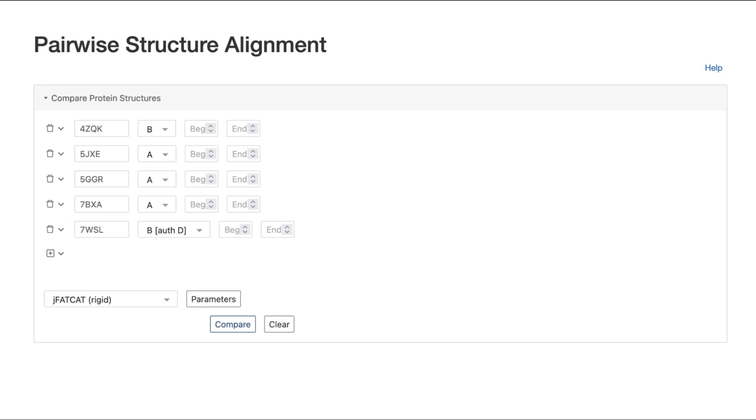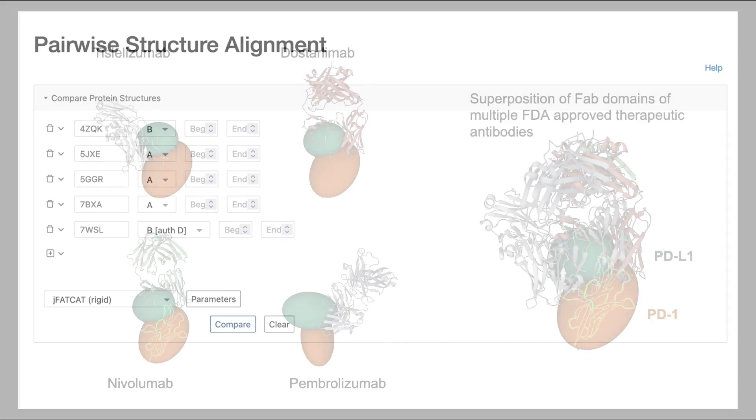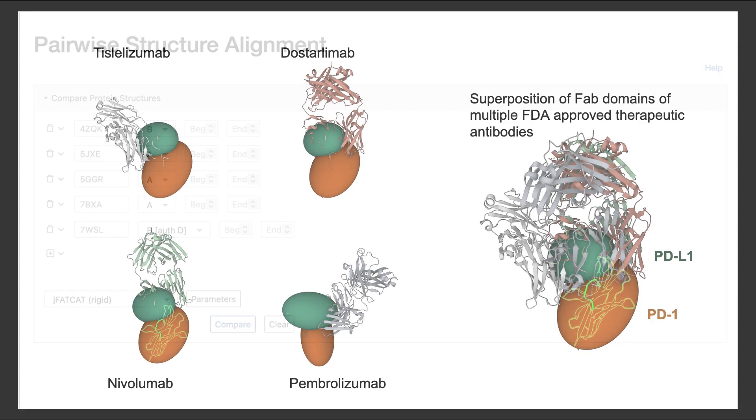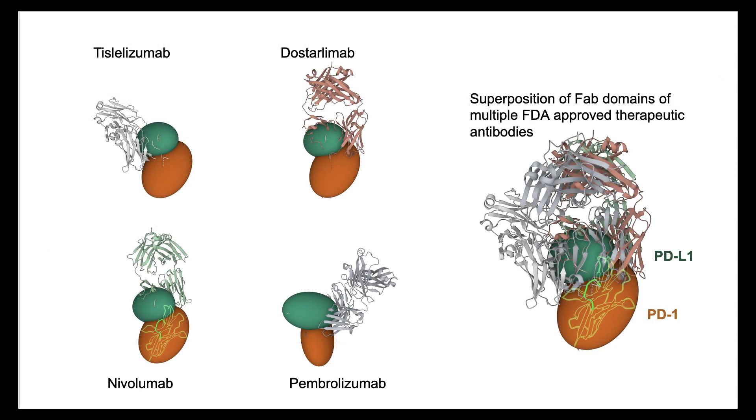Using the rcsb.org structure alignment tool, you can superpose the PD-1 structures from each of these complexes bound to the respective antibody Fabs. By displaying the structures view as we did in the previous video segment, you will see that each antibody binds to PD-1 in a slightly different location and interferes with PD-L1 binding.